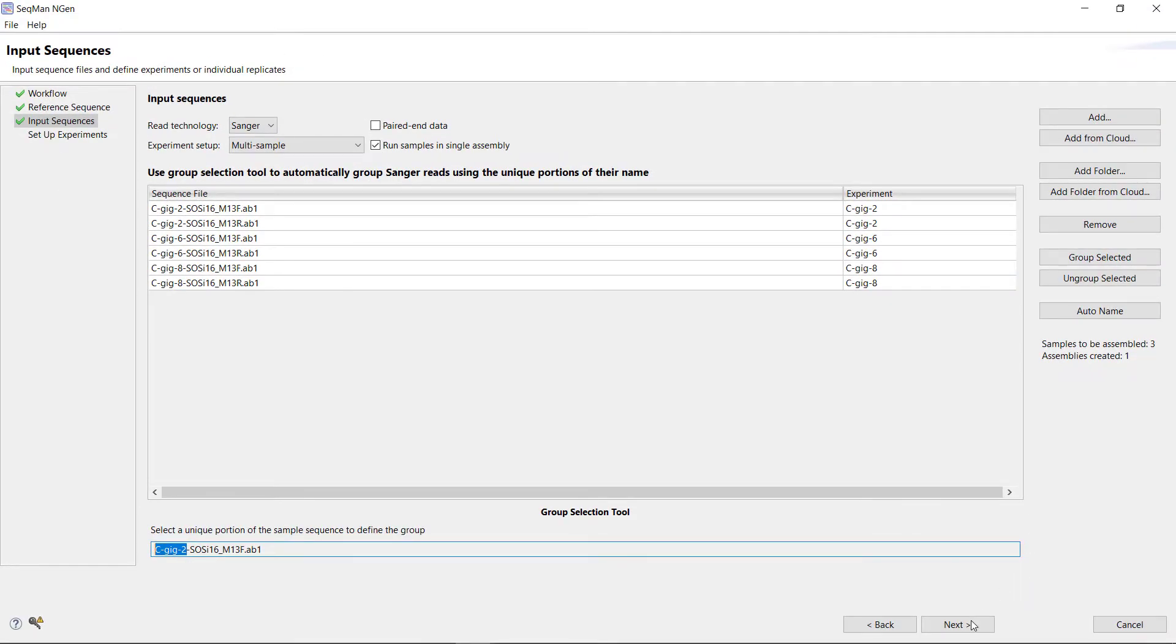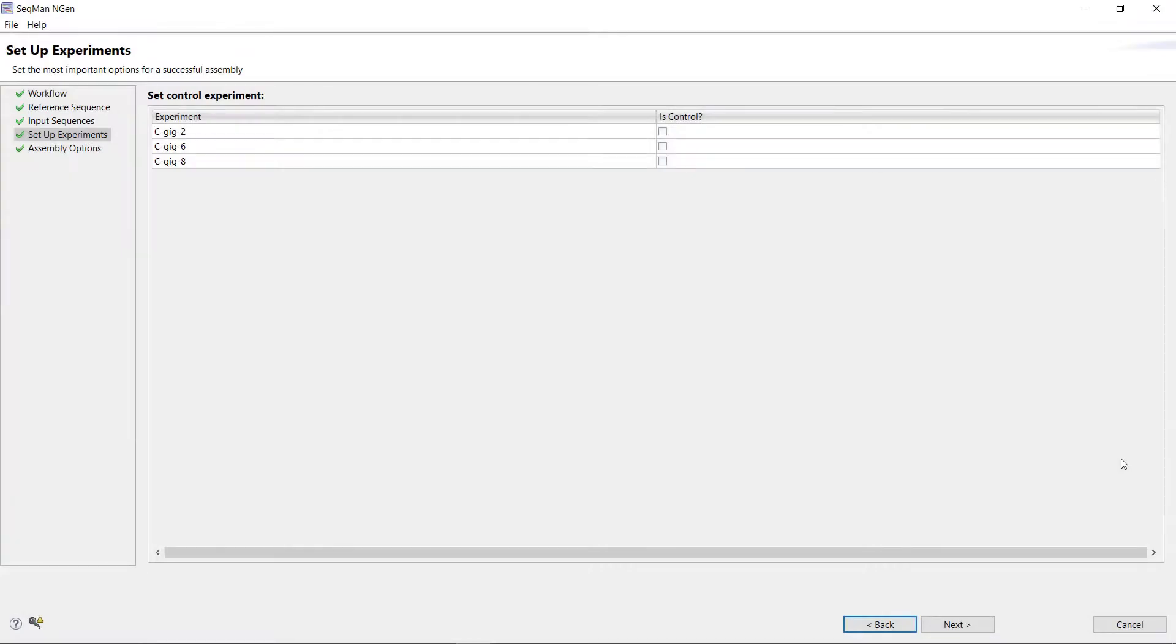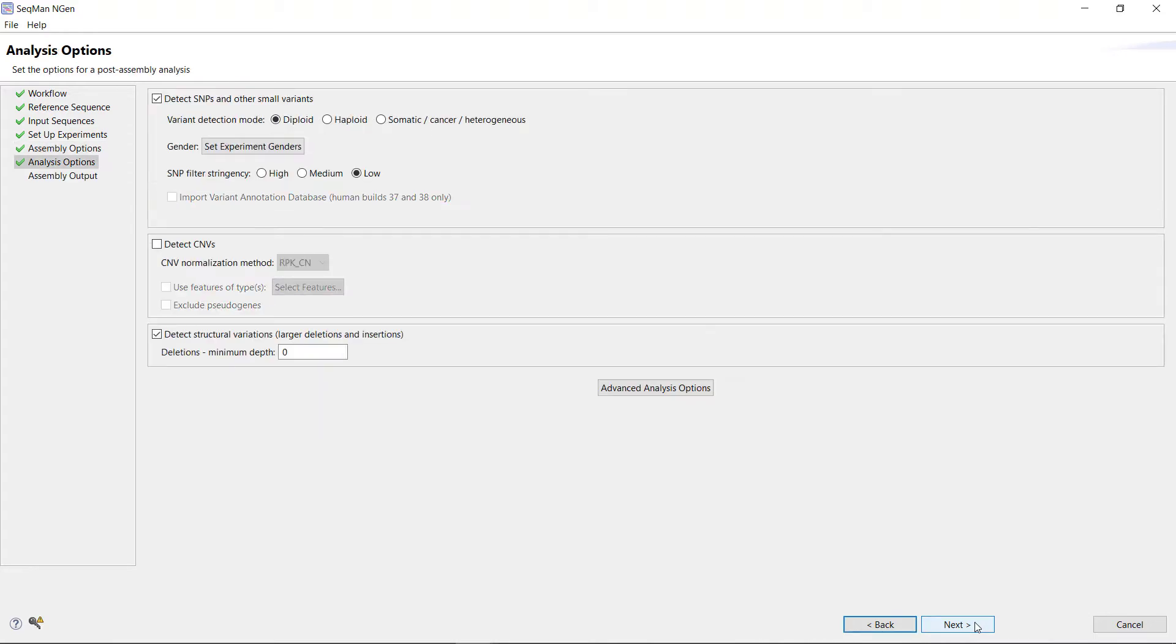Then, click Next. We will leave the Setup Experiment screen at its default, as well as the Assembly options. Click Next to skip through these two steps.